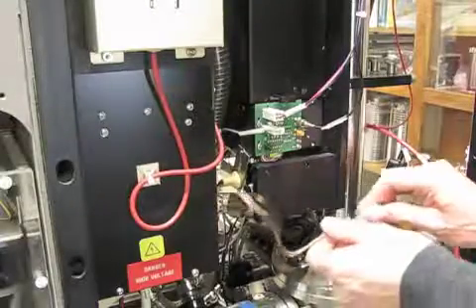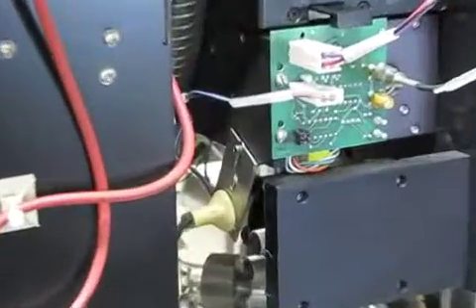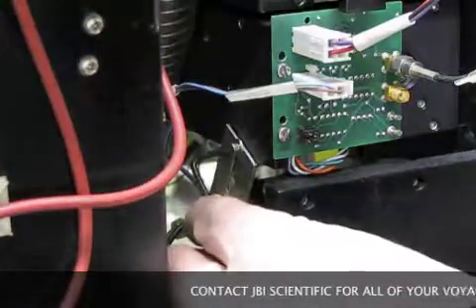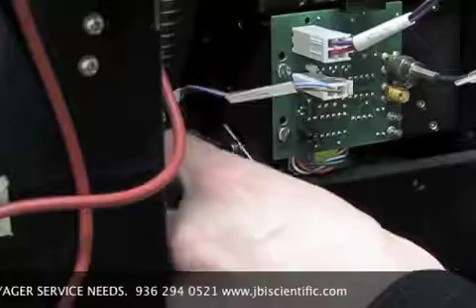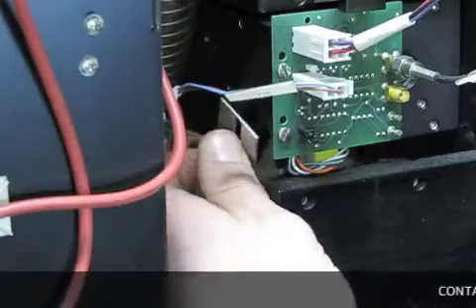With the Voyager control software running, remove the Voyager instrument covers and ensure that the high voltage interlock is removed. Disconnect the laser light 12 volt power going to the bracket. Use a 3/32 inch hex wrench to remove the hex bolt that attaches the bracket assembly to the attenuator.